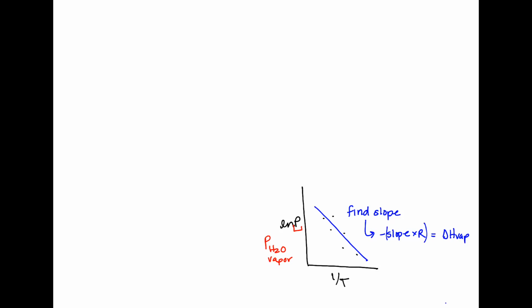But that's a little bit complicated. We've talked about how when you want to trap a gas, you usually trap it by bubbling it up through water or putting it in an inverted container in water so you can see where your gas starts and where the water around it begins. And so that's one of the complications for finding the partial pressure of water for this lab.